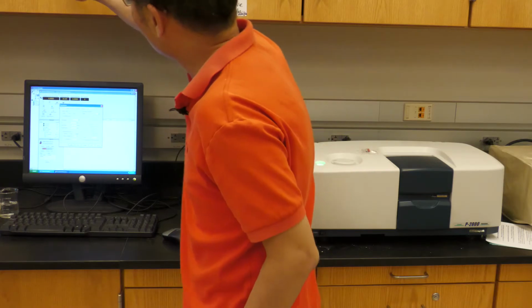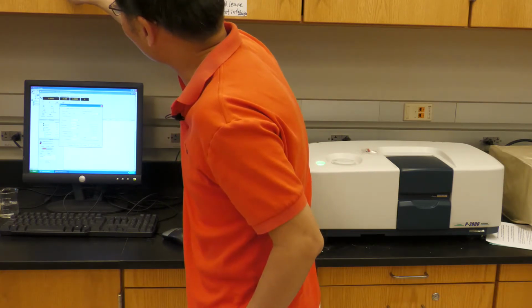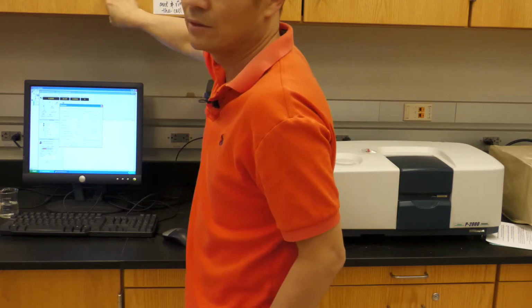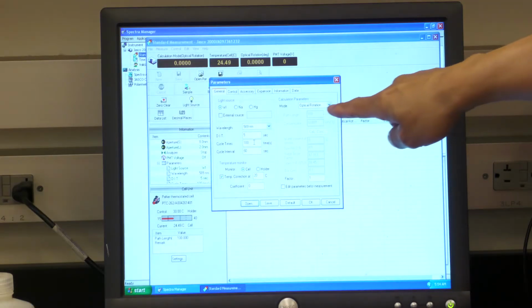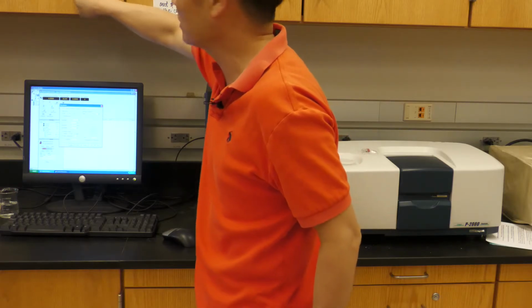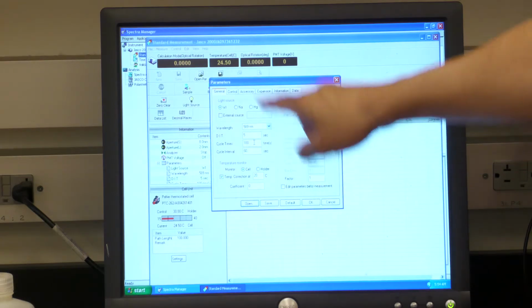For example, if your reaction is quickly going down, quickly reaches the plateau, you can stop it at 40. But we leave it at 100 maximum because after 100 it automatically stops. So if you leave it too short, it might automatically stop before they reach the plateau. So we leave the 100 points here.